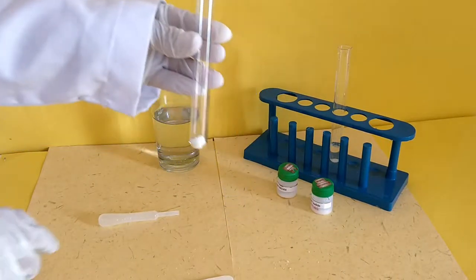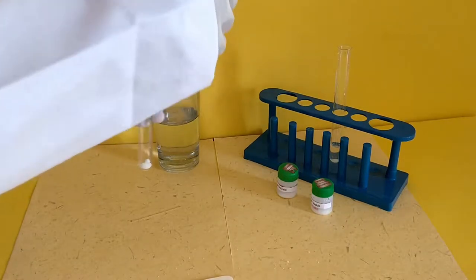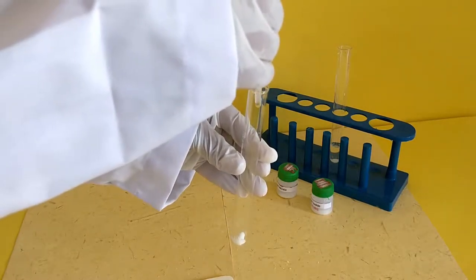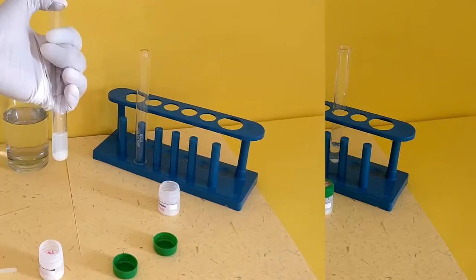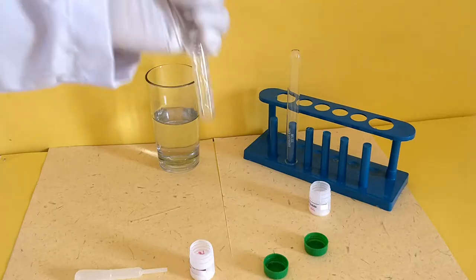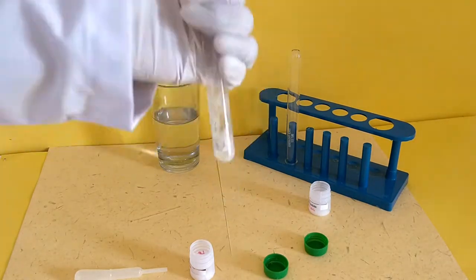Take about half a spatula full of lead nitrate salt in a test tube and fill it up to one-fourth full with water. Now shake the test tube till the salt is dissolved to prepare an aqueous solution of lead nitrate.